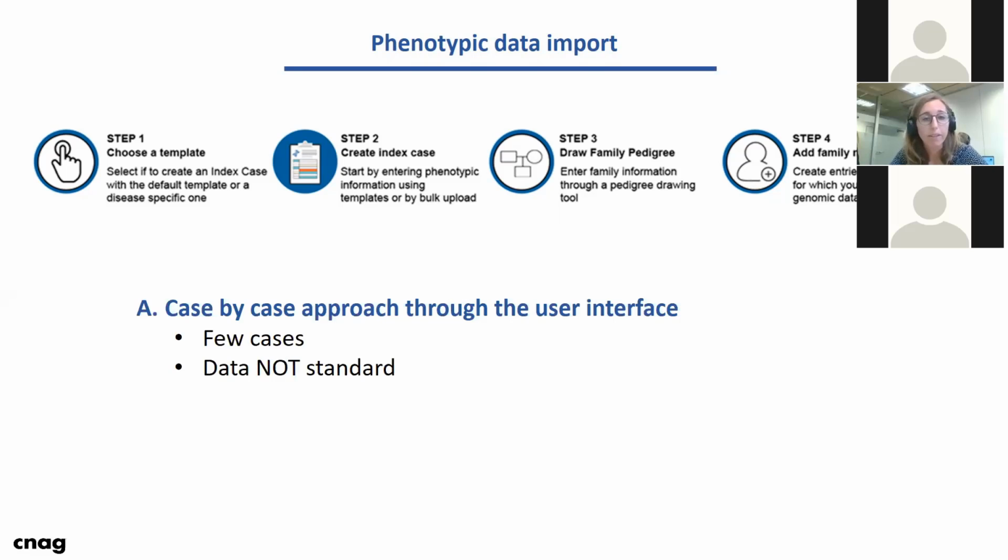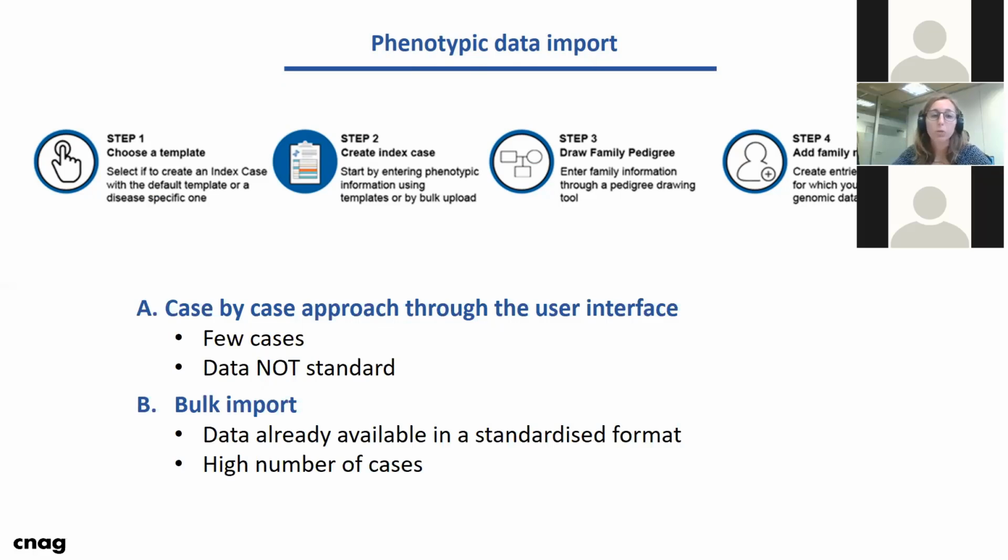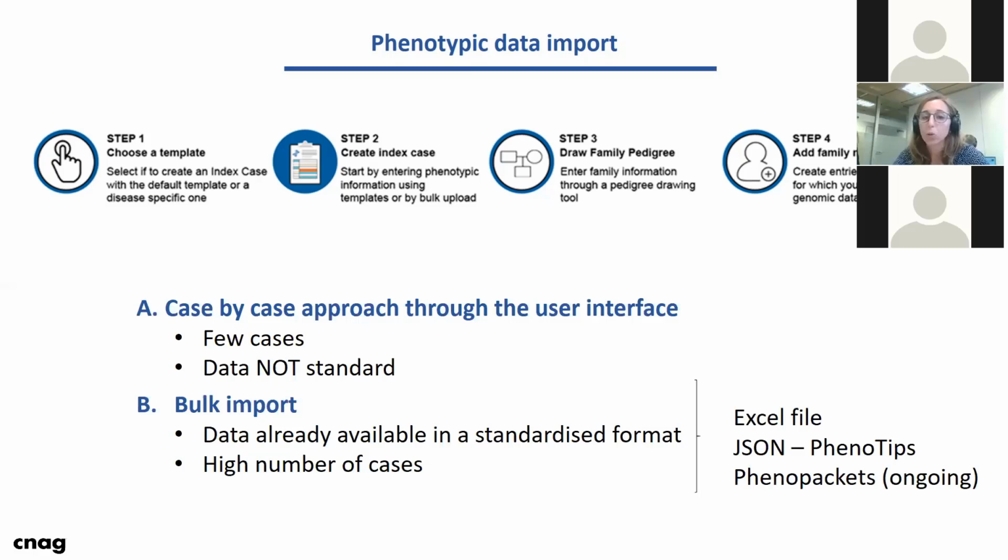And these steps can be done within the user interface using a case-by-case approach, and this is relevant when you have a few cases to enter or you don't have your data already standardized, and we'll see an example on how to do that later. But as we mentioned at the beginning, we also enable to bulk import your phenotypic information. So if you already have this data in a standardized format in another system, we'll provide different means to directly import it through Excel files.